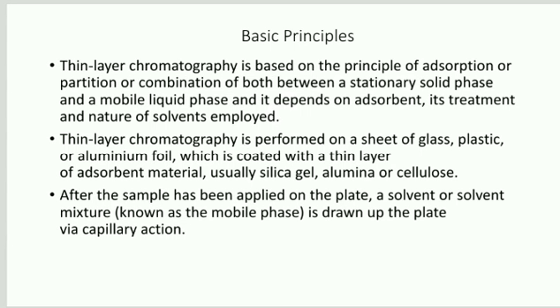Thin layer chromatography is performed on a sheet of glass, plastic or aluminum foil which is coated with a thin layer of adsorbent material, usually silica gel, alumina or cellulose.